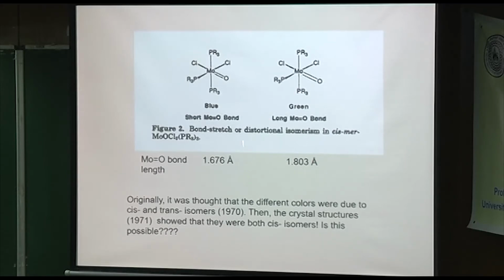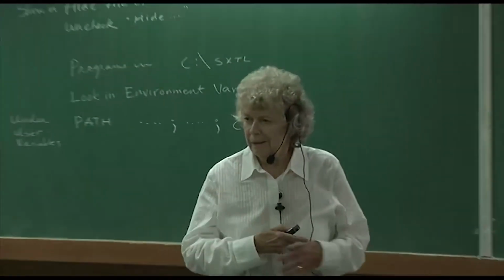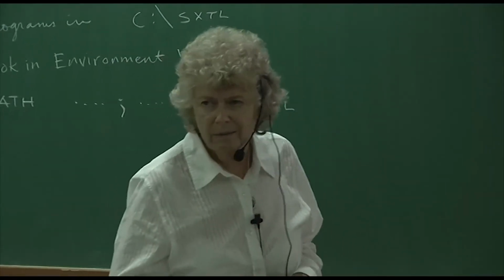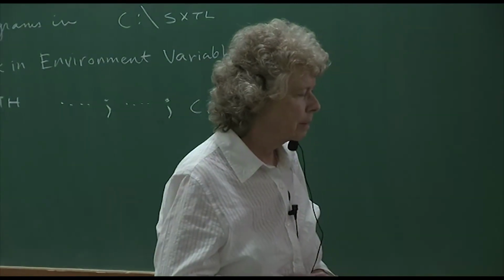And how do you do the refinement then? You know what the distances should be, by the sum of the covalent radii, or from looking at the CSD. So you fix them, you restrain them to those distances in the refinement. And if your assumption is correct, that refinement will be well behaved and the R value goes down and everything looks great. So that was actually what was going on.